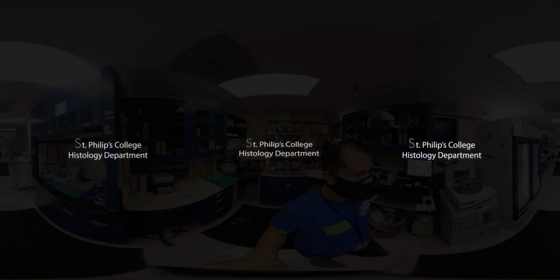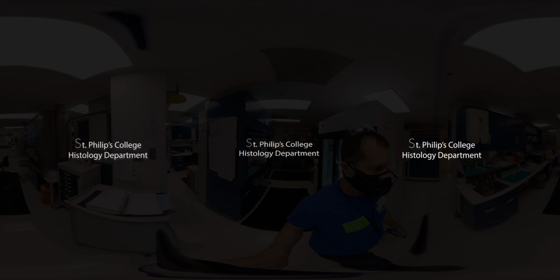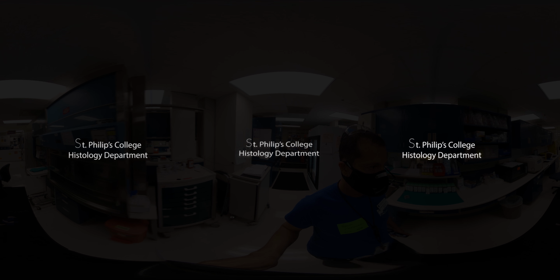Just like the first lesson, this lesson will have a few questions at the end, but keep in mind, what is important is that you understand the connections between each work area. Before we get started, let's do a quick review of the 6 work areas.